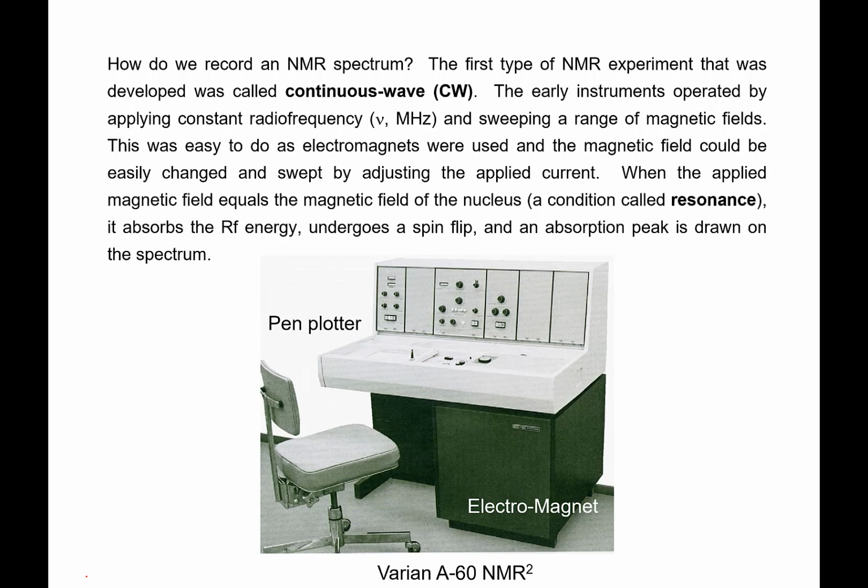So this is what that did. It didn't even have a computer. It had a pen attached to a thing that moved across the piece of paper and drew the signals. Ours had things in here that you had to take out and jiggle and put back in. Tubes and stuff. When I was a senior, we were taking organic synthesis or something. I said, can I go down and use the NMR? And they said, oh, sure, okay.